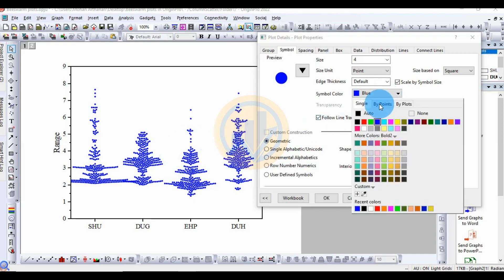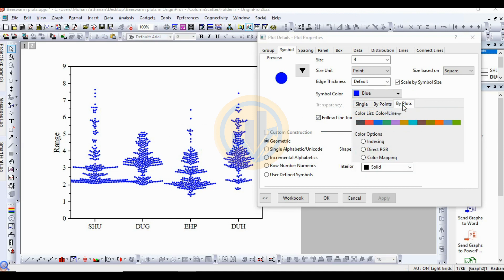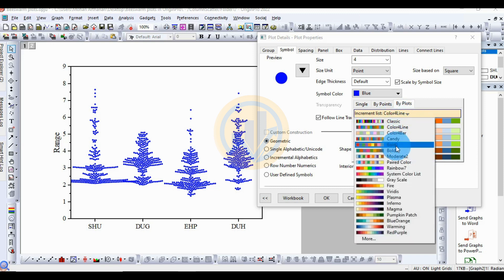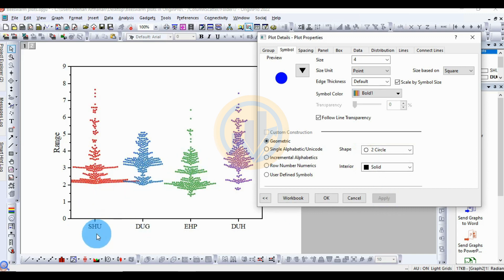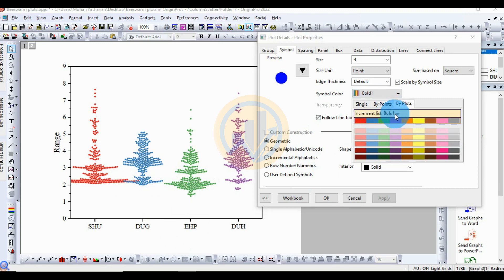The next option is bi-plot. This changes the line color for each group. With bi-plot, four different colors are applied. I choose bold color. Apply it — the first dataset changes. Then the next one changes to blue, and the third one to green. You can choose any color you prefer.